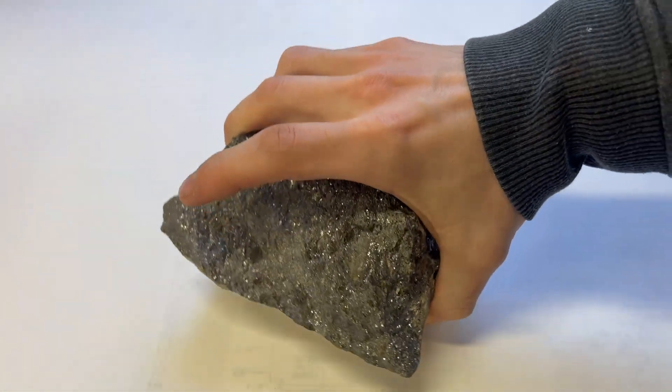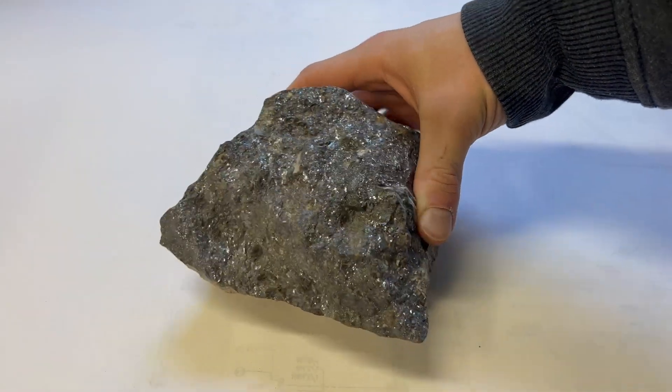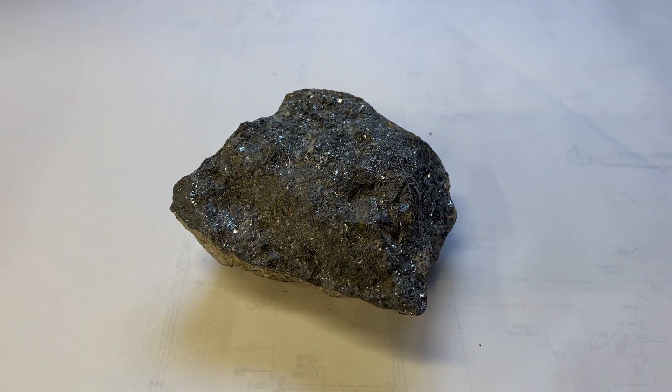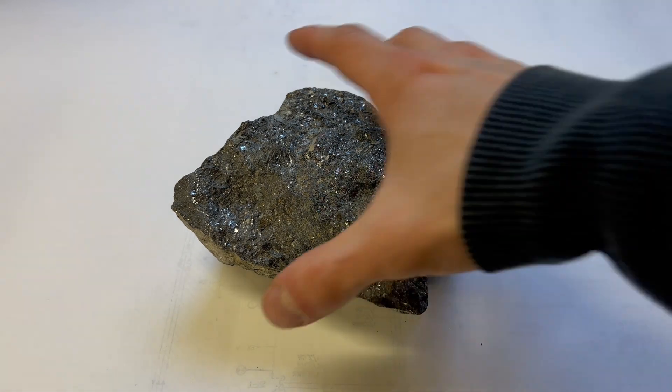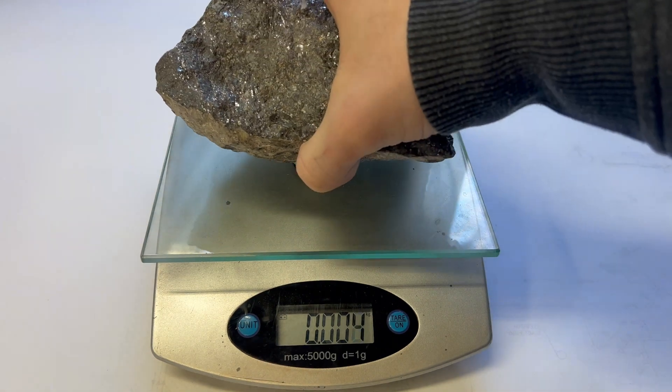This is a hunk of silver ore, and today we will make it into silver metal. Welcome to Wheeler Scientific, and this is a continuation of the Element series. Last year I made my way out west to collect some ores, and one of those ores was this hunk of silver.